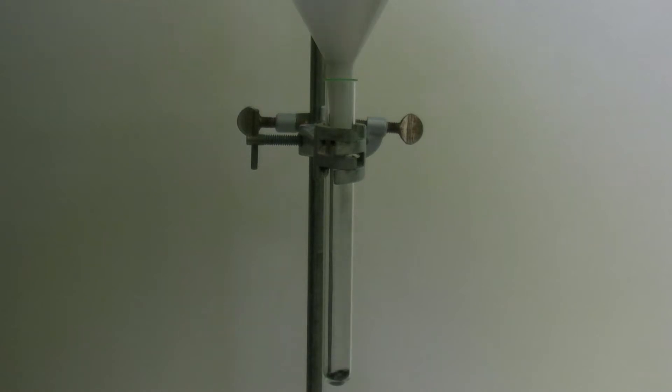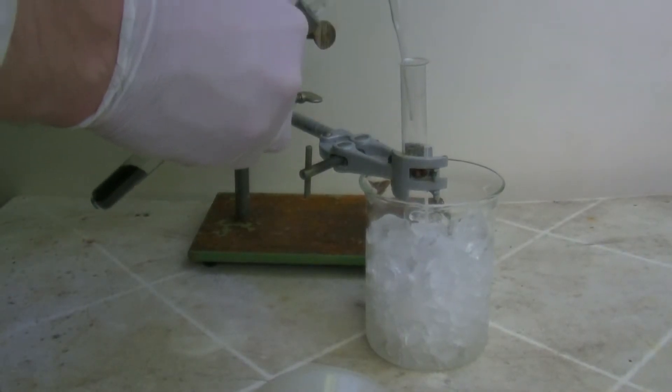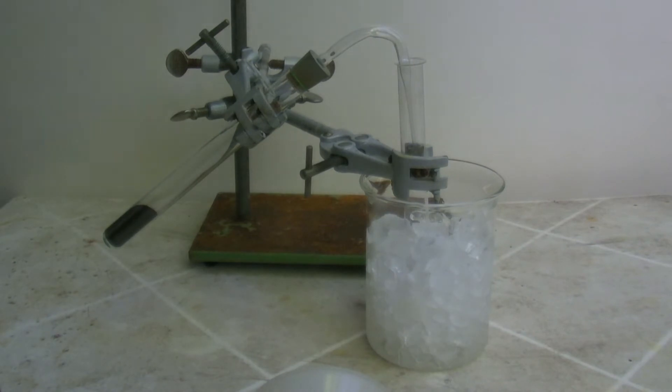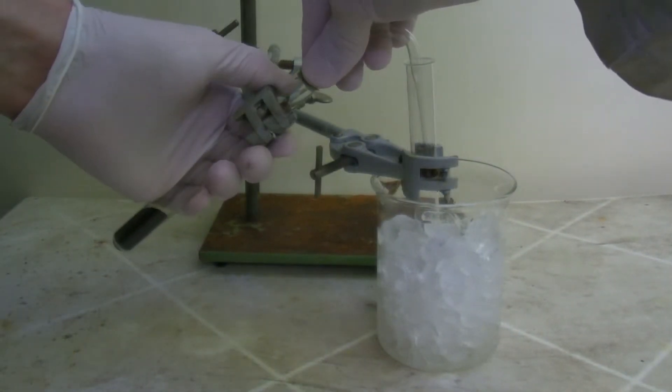Then the mixture is added to a test tube which is attached to a ring stand. Later on, the test tube will be closed with a stopper with a bent pipette which is hanging into a second test tube. The latter is cooled with an ice bath.